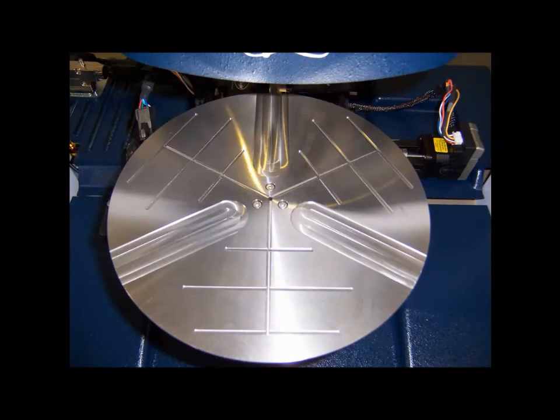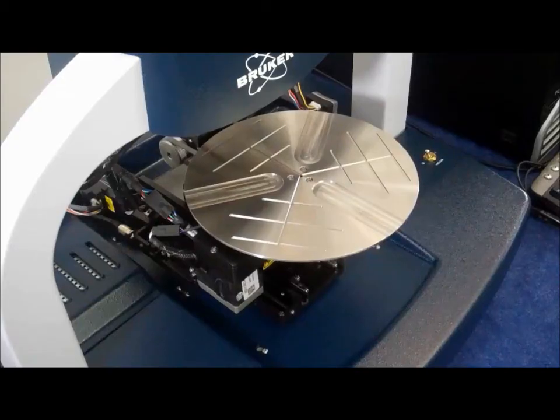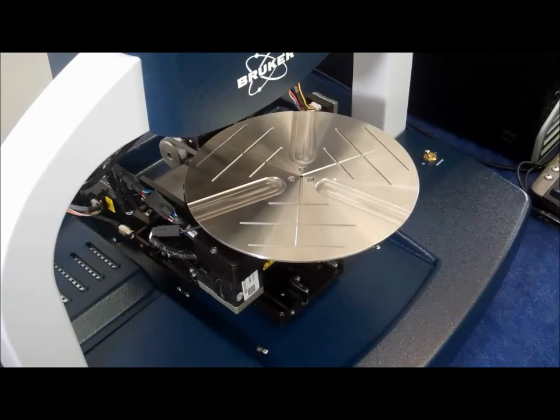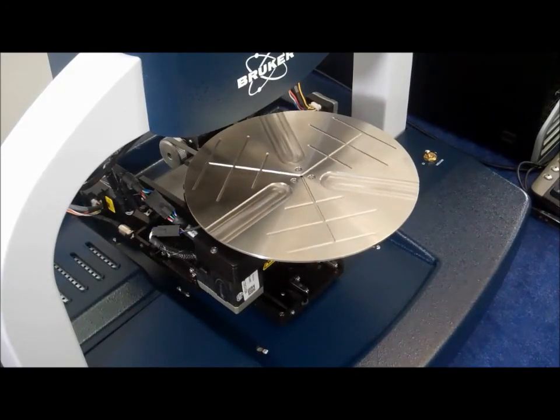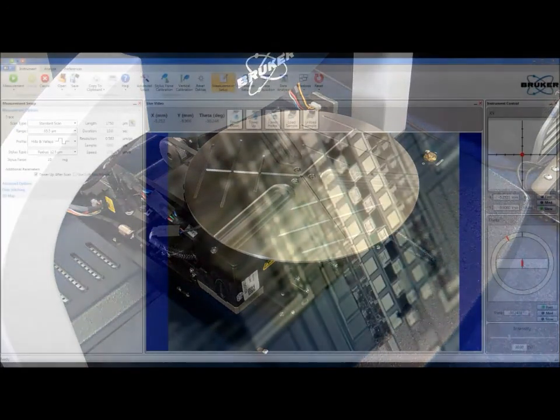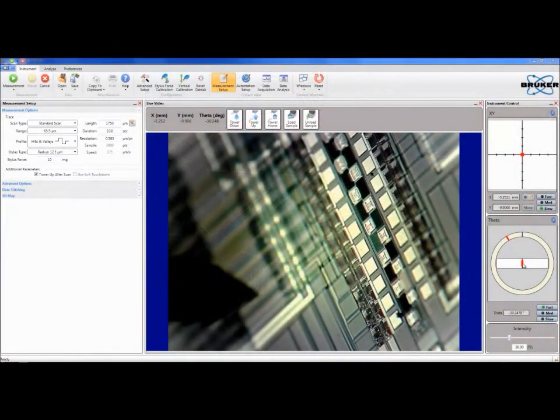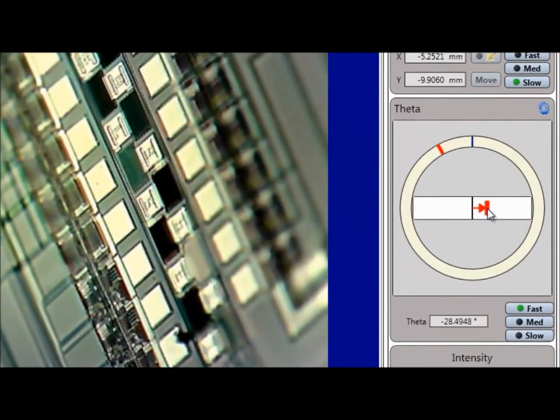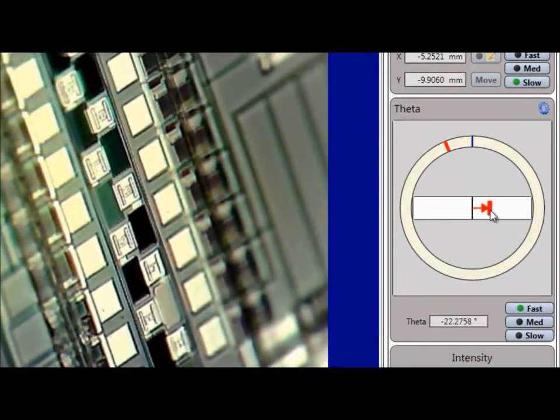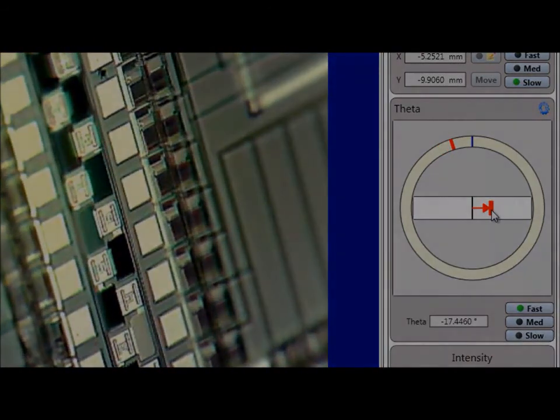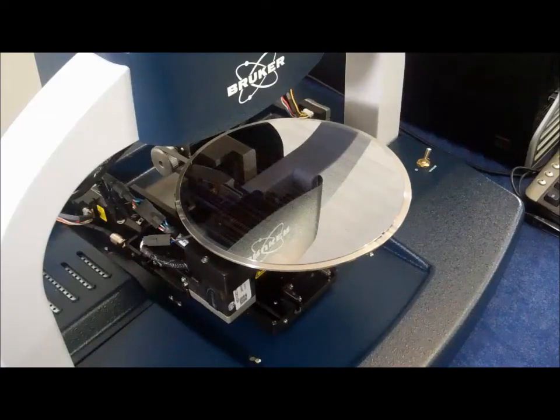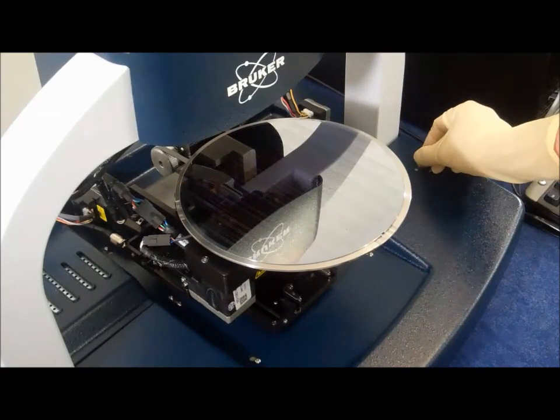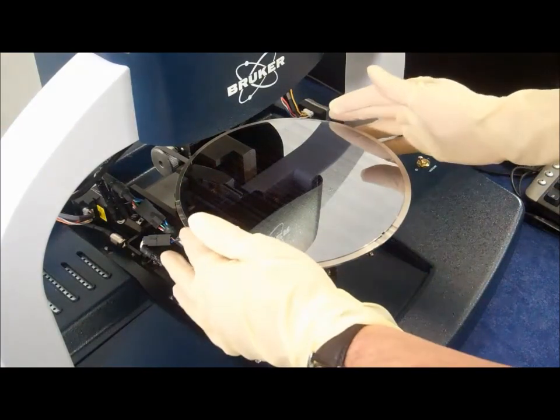A variety of wafer vacuum chucks are available for the DECTAC XT. These can be used with DECTAC XT systems that are configured for both manual theta or automated theta capability. A manual knob is used to adjust manual theta stage rotation while the automated theta stages are controlled directly from the Vision 64 interface. A built-in vacuum switch allows the operator to easily turn vacuum on and off to hold or remove wafer samples.